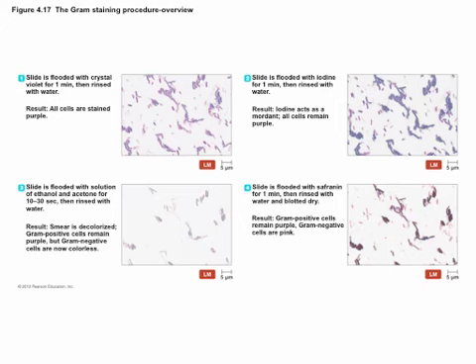Okay? Thick cell wall here. What happens is that the crystal violet gets inside. And this is, if you recall, sort of like a mesh. And the crystal violet gets inside and gets stuck in the mesh. And it does that in both cells. And you'll notice, if you do a gram stain, that actually they both start out looking purple.